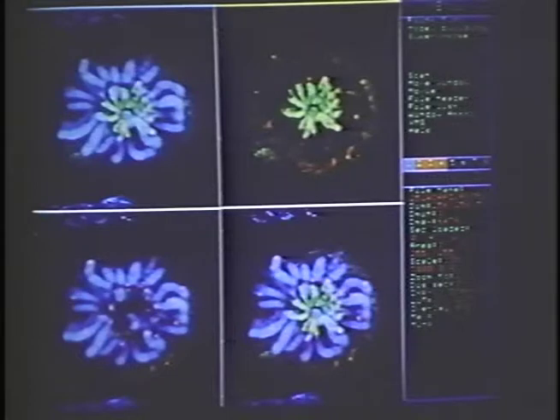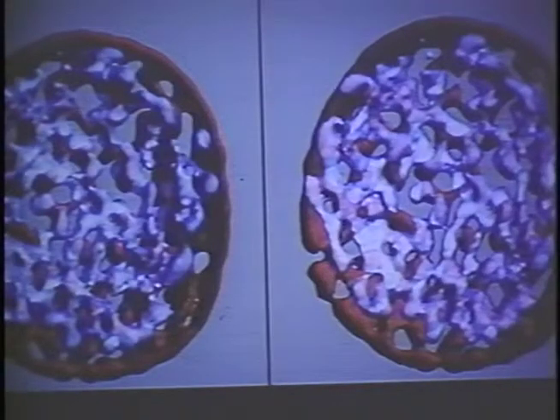This just shows an example, obviously not from electron microscopy, but from light microscopy. And all I wanted to highlight here is that, again, in these independent windows, you can be superimposing different data sets simultaneously and using different color displays as a way of superimposing that information. So if you had the same specimen stained in several different ways, you could superimpose those images on top of one another to compare and contrast the results. This, as I said, is from light microscopy showing 3 different stains. This is actual 3-dimensional light microscopy work that's done in the lab.